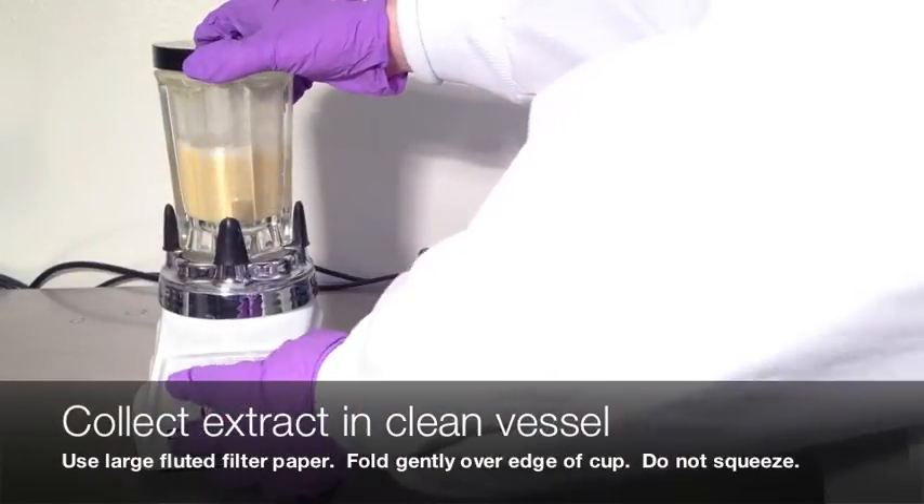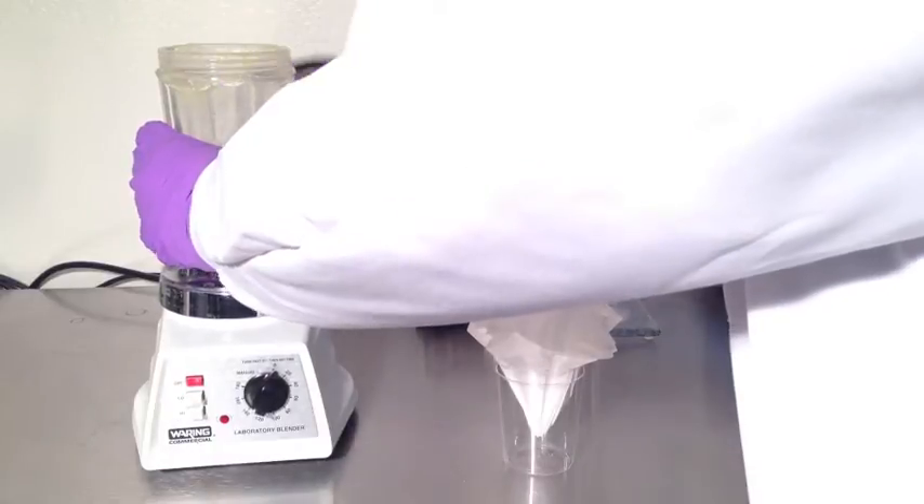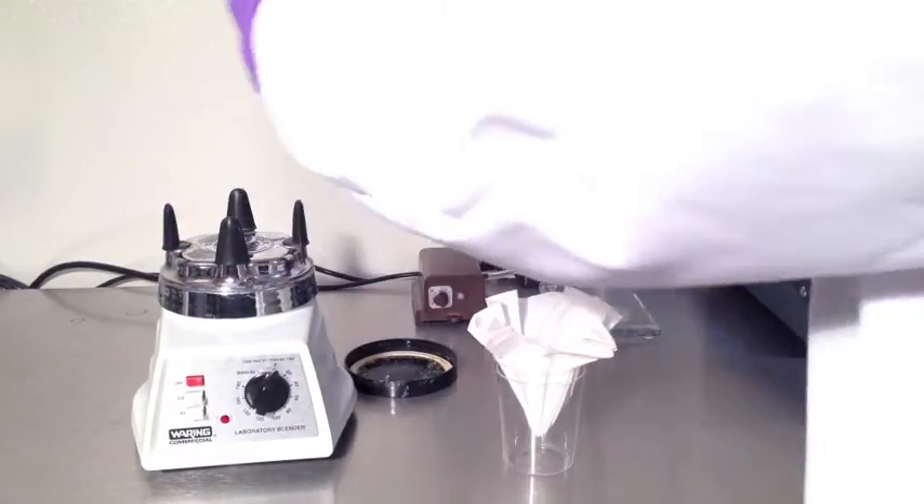Gently fold the edges of the fluted filter paper over the clean collection cup, and collect the filtrate in the cup through the filter.